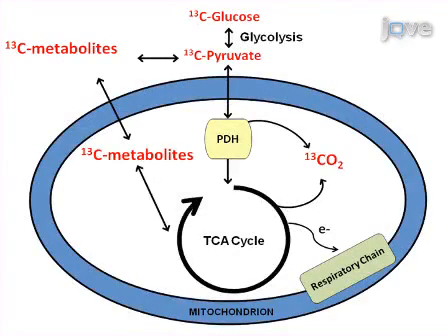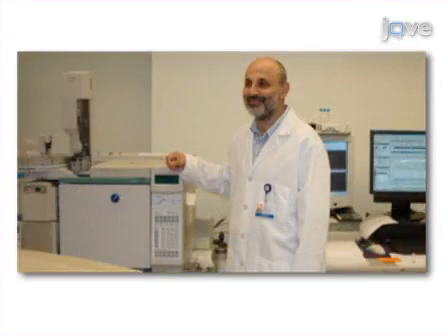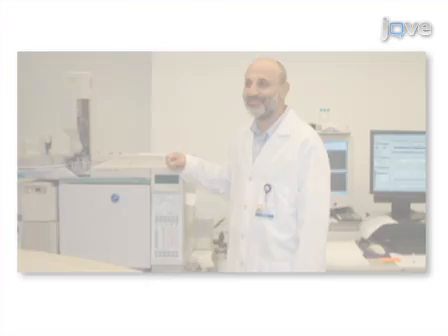As a second step, isotopic incorporation in atmospheric and dissolved carbon dioxide are measured by gas ratio mass spectrometry, which provides more direct assessment of intermediary metabolic flux over short periods of time. Next, samples are processed for whole worm free amino acid analysis using HPLC, as well as by isotopic enrichment in amino acids and organic acids by GCMS, in order to quantify metabolic flux alteration in nematodes following stable isotope exposure.